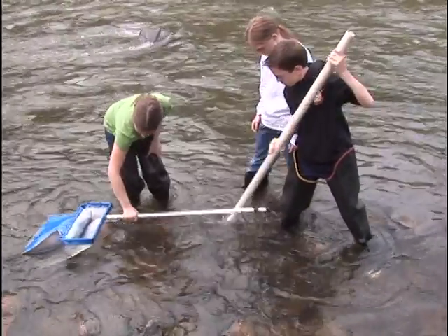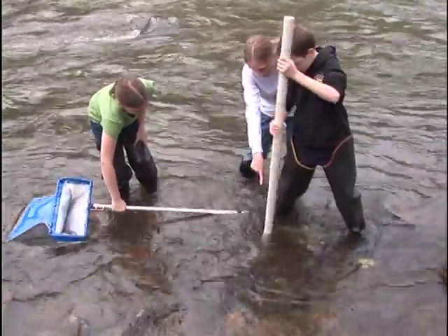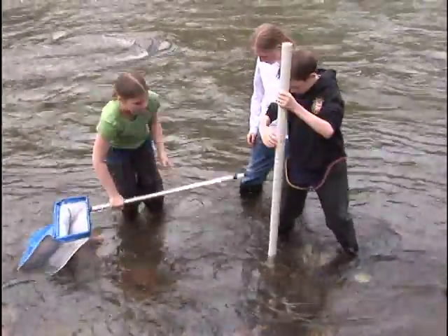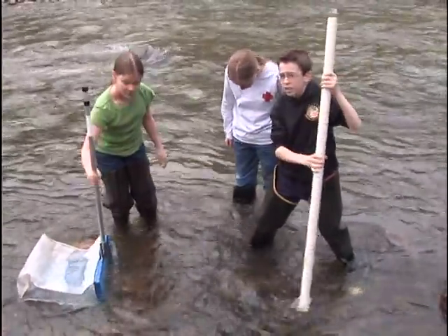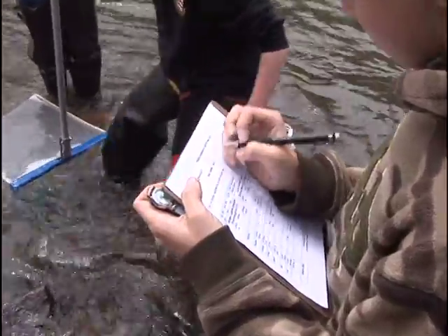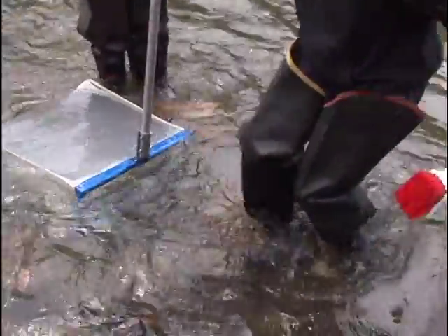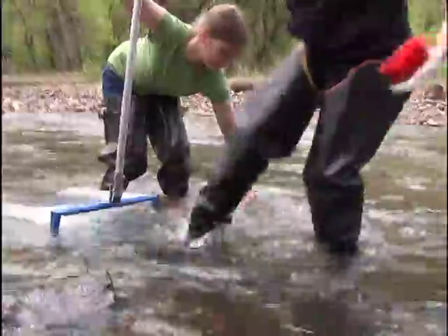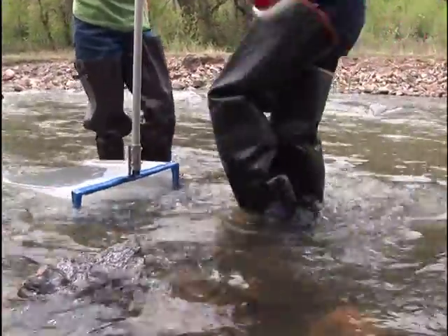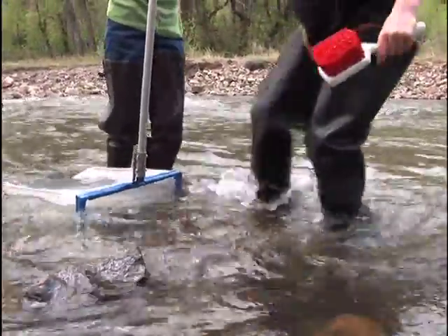Once your data recorder has labeled the kick number and whether you are sampling in a fast or slow riffle, it's time to kick for bugs. Begin your kick by placing the net in the water on the bottom of the stream. Once your timer calls out for you to begin your kick, the kicker begins by using their toe and heel to disturb, dislodge, and uproot the upper layer of substrate. Begin at the upstream portion of the kick area and move down towards the net.